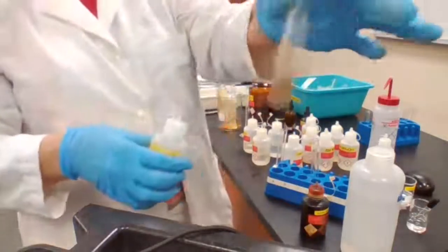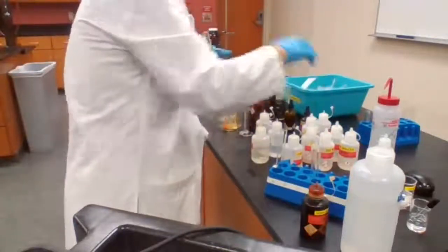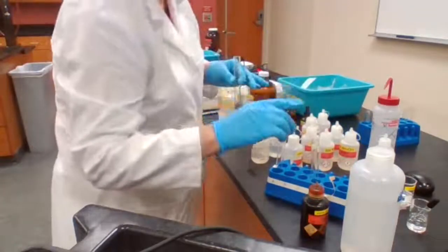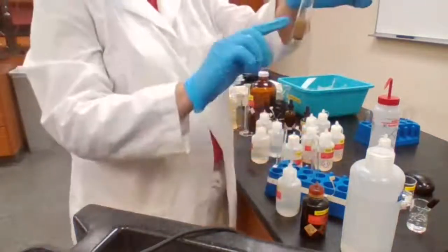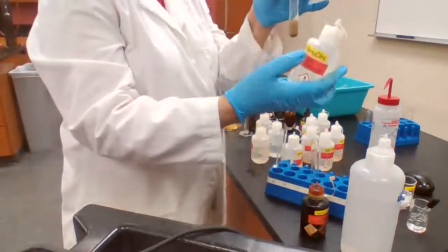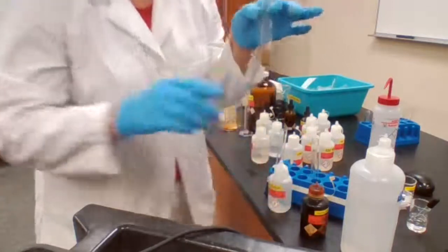Now, when I have the black precipitate, I have to add ammonium hydroxide, the 6 molar ammonium hydroxide, until it's completely dissolved.